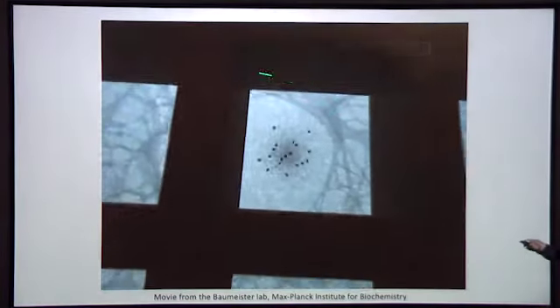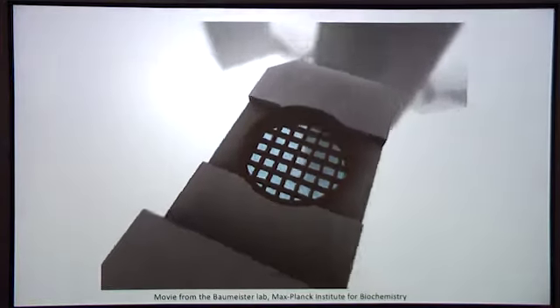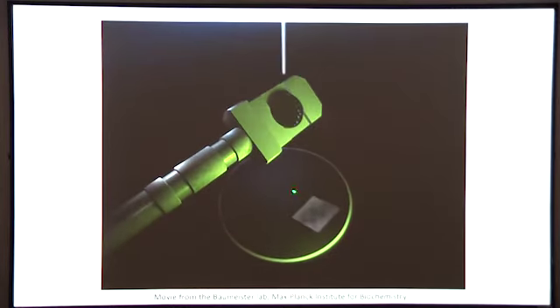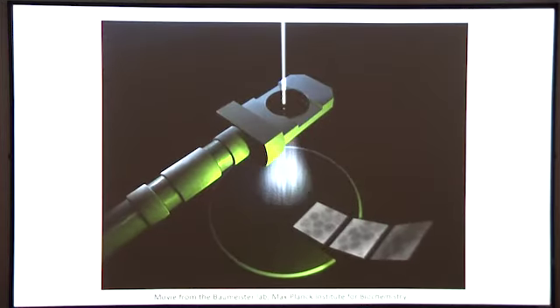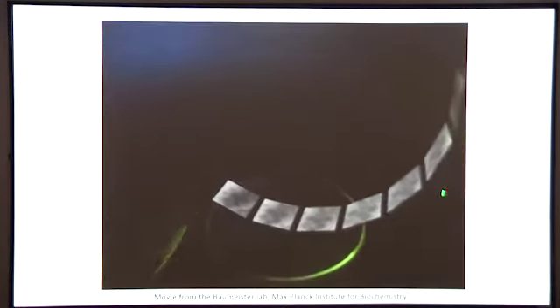And then we end up with a thin layer of sample, which is on an EM grid. You can see this is a side entry holder. It's stuck into a microscope. Rotated, it's imaged, an image is collected onto a camera, and the holder is rotated, imaged, and we do this repeatedly. And in this way, generate a whole series of different projection views of this, in this case, what is a little cluster of virus particles.